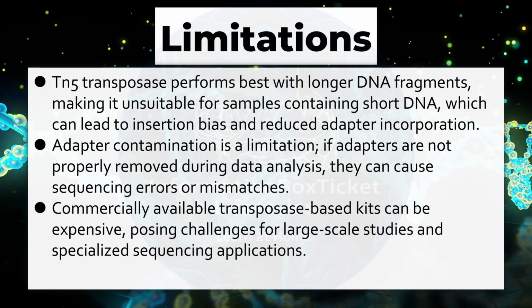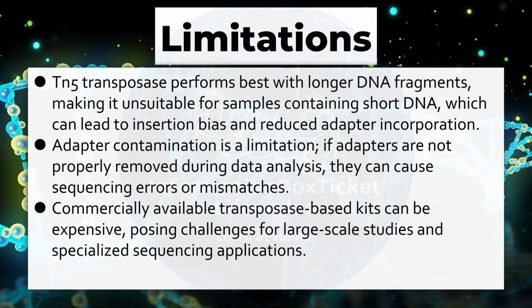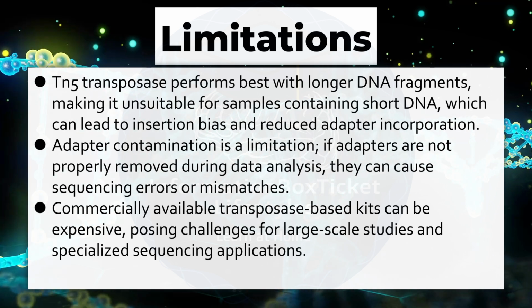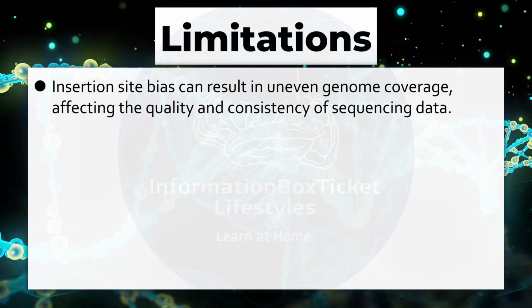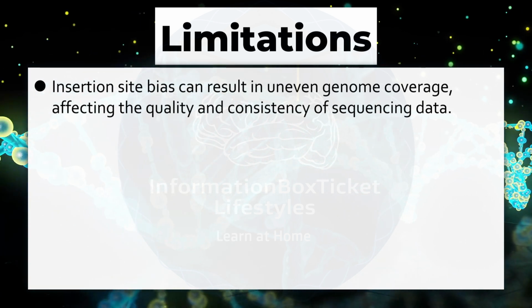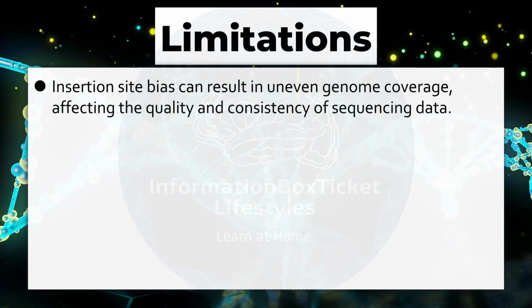Commercially available transposase-based kits can be expensive, posing challenges for large-scale studies and specialized sequencing applications. Insertion site bias can result in uneven genome coverage, affecting the quality and consistency of sequencing data.